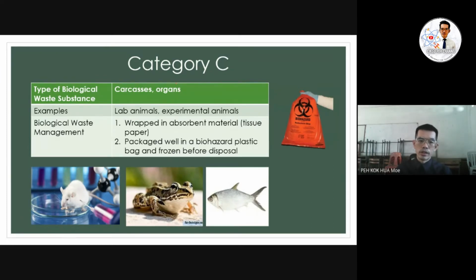Category C is carcasses and organs. Here we have the figures of rats, frog, and fish. That means the animals will be dead after the experiment or other science activity. So we cannot just throw them away into the sink, as mentioned just now.